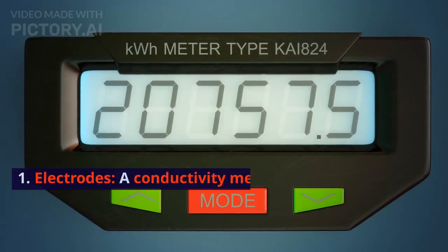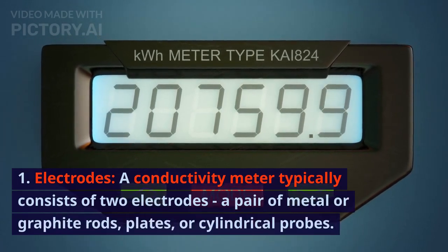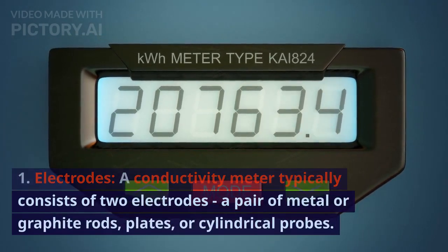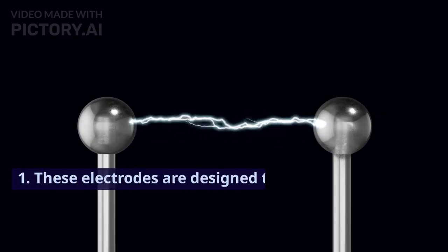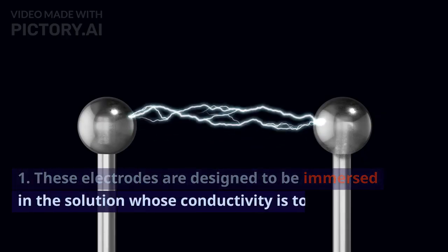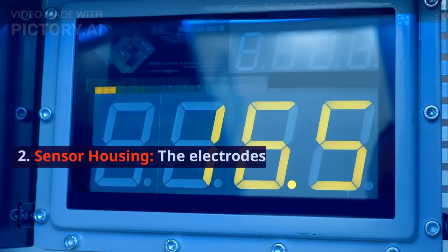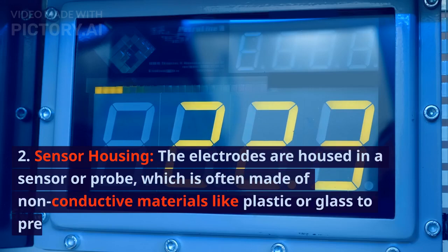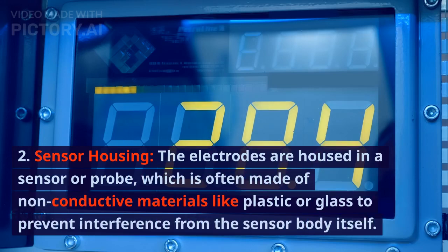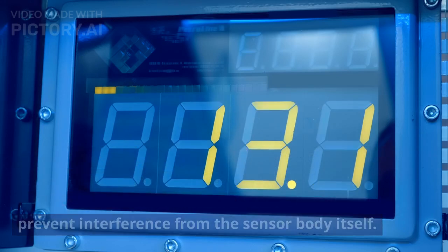1. Electrodes. A conductivity meter typically consists of two electrodes, a pair of metal or graphite rods, plates, or cylindrical probes. These electrodes are designed to be immersed in the solution whose conductivity is to be measured. 2. Sensor housing. The electrodes are housed in a sensor or probe, which is often made of non-conductive materials like plastic or glass to prevent interference from the sensor body itself.